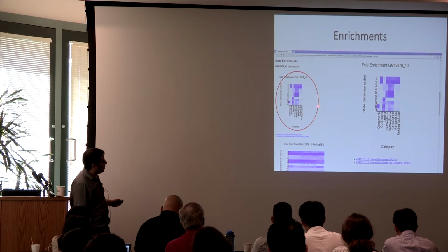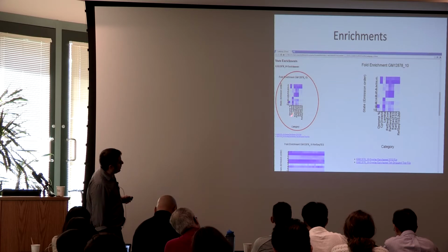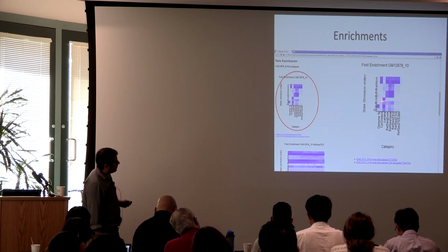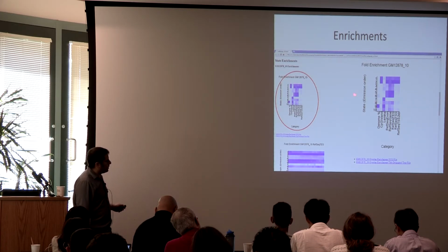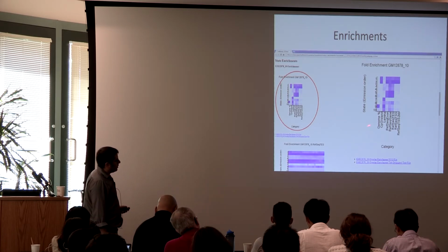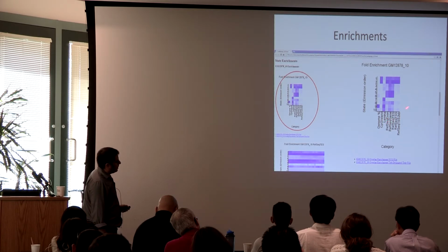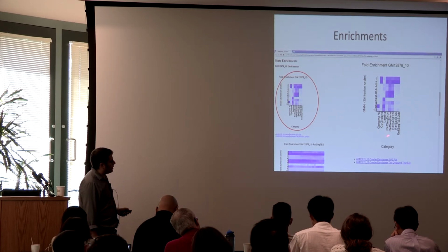The next thing, I've scrolled down some, is state enrichments. Within ChromHMM, there's a directory tied to that assembly with various previous annotations. The first column tells you for the states the relative frequency of that state in terms of genome coverage. And then it's showing you in the additional columns the enrichment for CpG islands, the nuclear lamina, RefSeq annotated exons, genes, ends of transcripts, transcription start sites, and promoter regions, defined as plus or minus 2 kb.